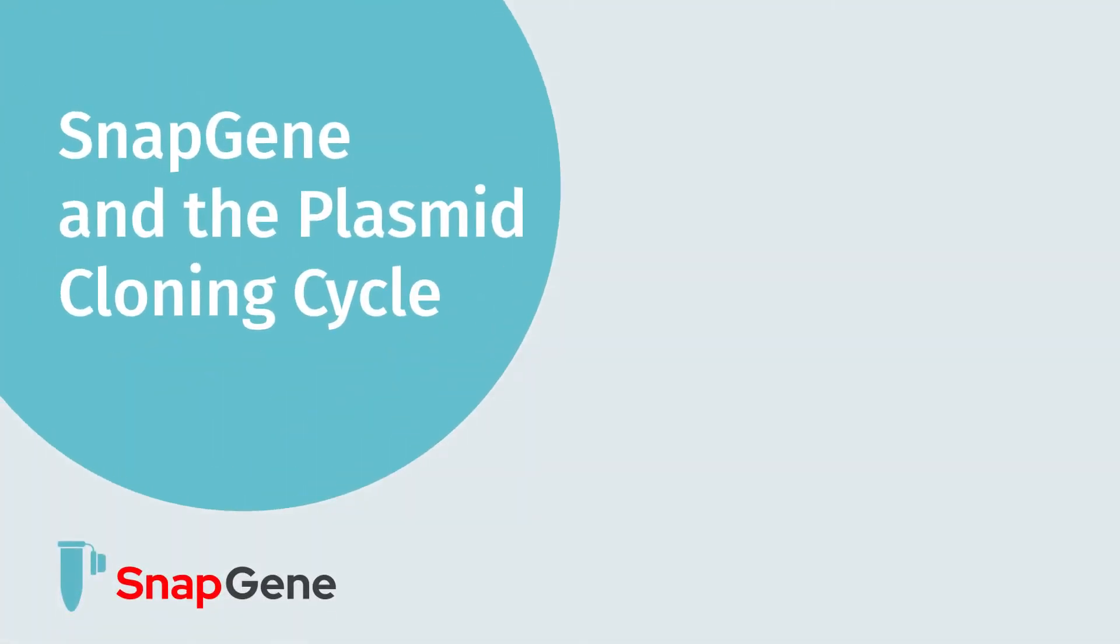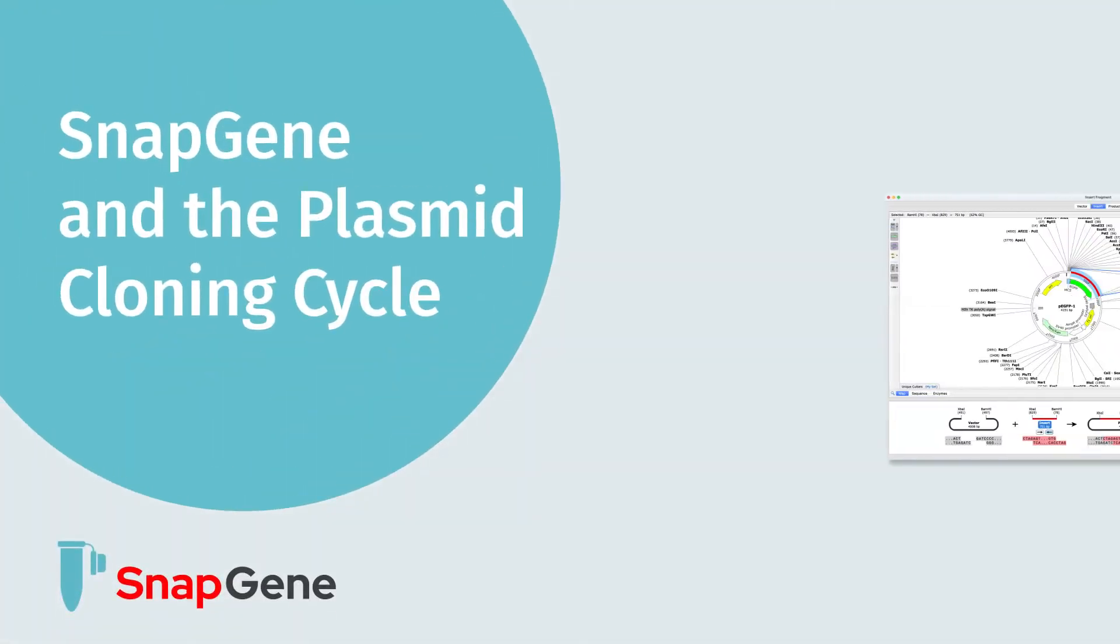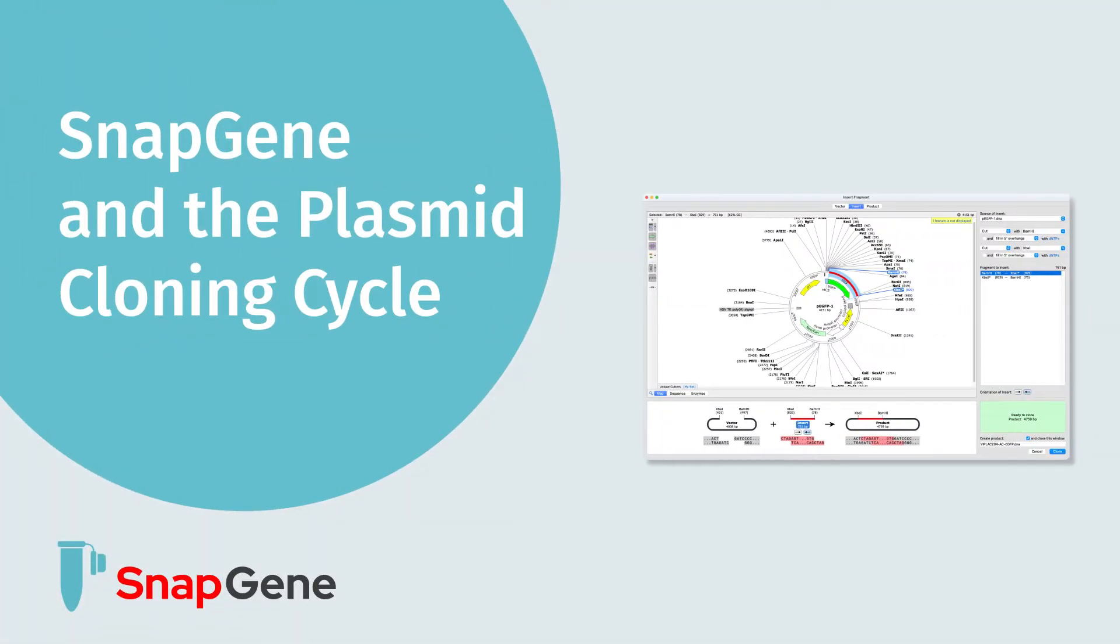Hello, in this video we are going to review how SnapGene helps with the plasmid cloning cycle.